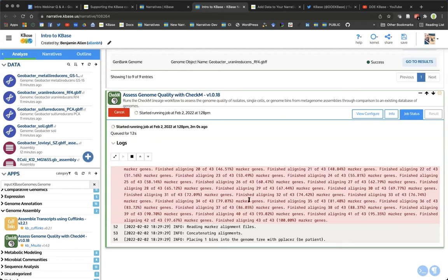So this is just a really helpful way where we've built this whole nice graphical user interface. This will give you the ability to investigate anything that's happening at the granular level with any of the programs that you're running, and have a little bit more of that traditional control you would have running in the command line, at least for diagnostic purposes.